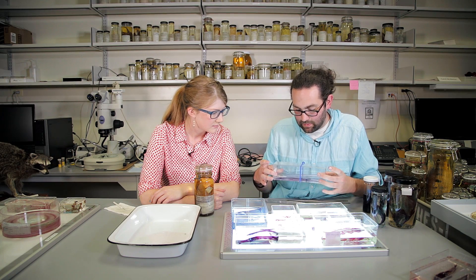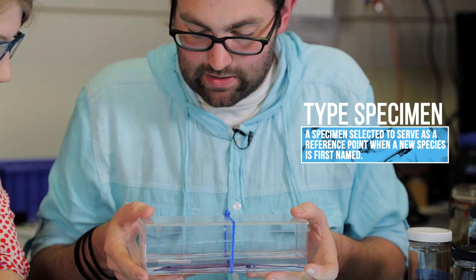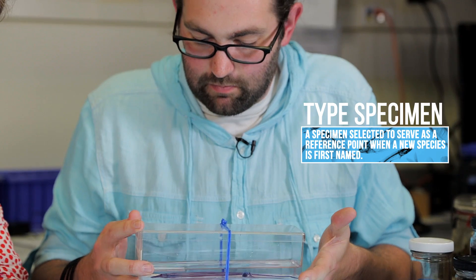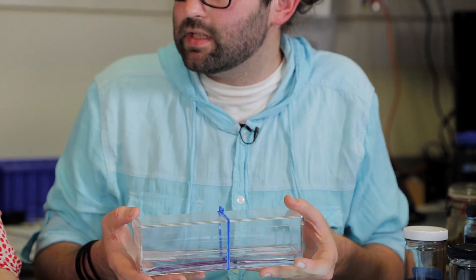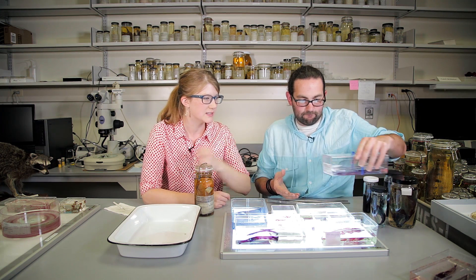For instance, this is one of the type specimens of a knife fish. It was cleared and stained as part of the description of this species to show how the skeleton was different from other related species. So scientists don't see this process as destructive at all — they see it as informative. Yes, absolutely.